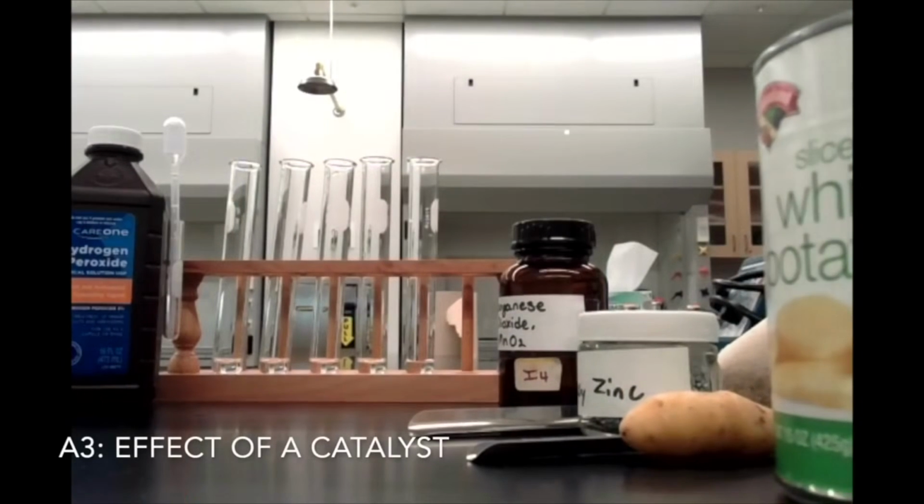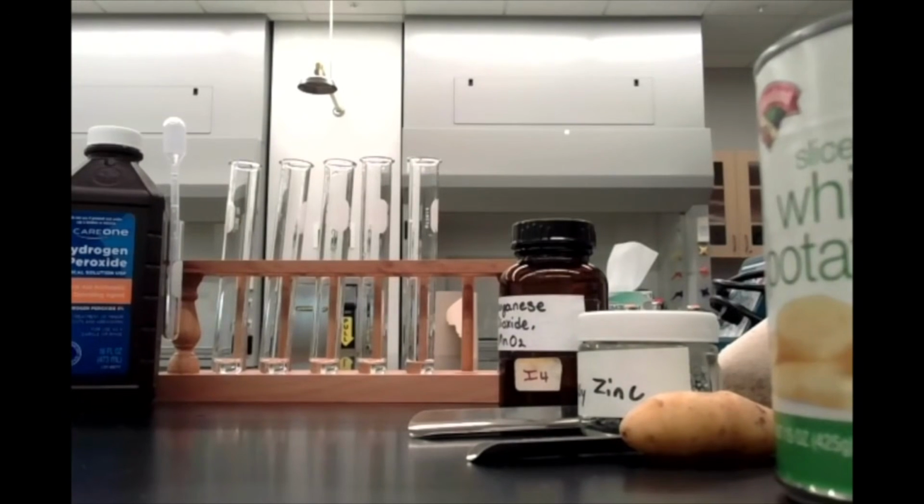In this part of the lab, we are going to take different catalysts, or things that could be catalysts at least, and add them to the decomposition of hydrogen peroxide. Now, if you recall from an earlier lab, hydrogen peroxide decomposes into water and oxygen gas, but this reaction is very, very slow. We sped up the reaction last time using some potassium iodide, and in this lab we're going to try a few other things to speed up this really slow reaction.